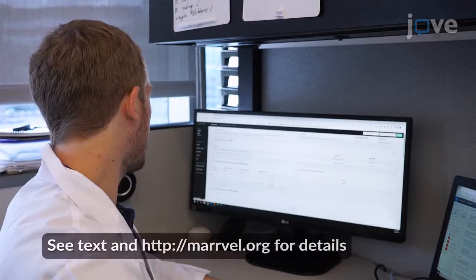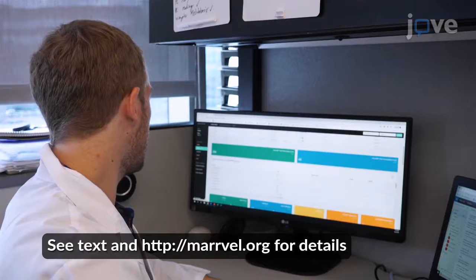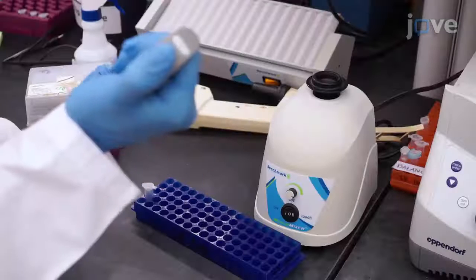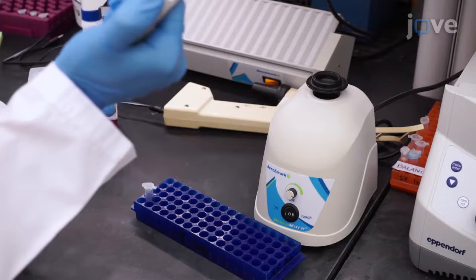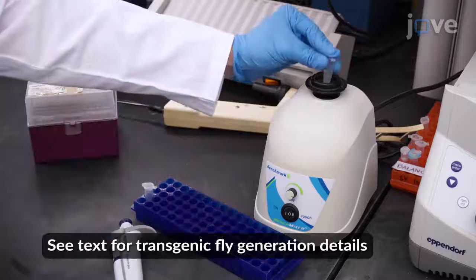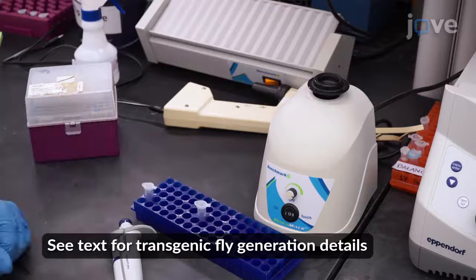Before beginning the procedure, gather information about the human gene of interest and its model organism orthologs. To test variant function by overexpressing reference and variant human proteins in the fly visual system, generate transgenic flies that express reference or variant human cDNAs of interest under the control of the Gal4 upstream activating sequence, or UAS, system.